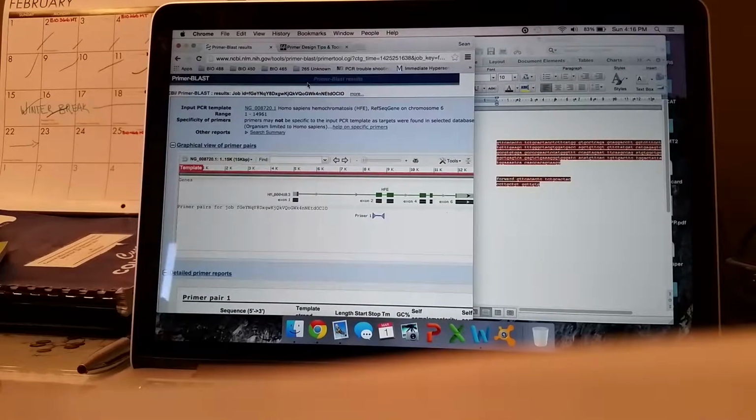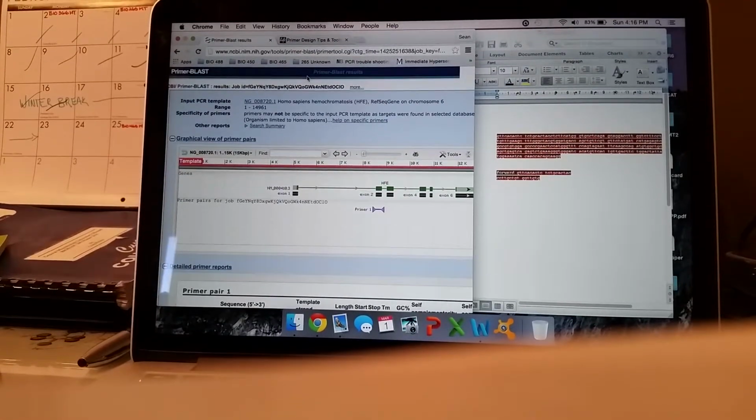The last one is Sanger sequencing. You read it from the bottom up. Bottom up is 5 to 3 prime. And you can just write that on your little template there on the back page of the assignment. So it's 5 to 3 from bottom to top.